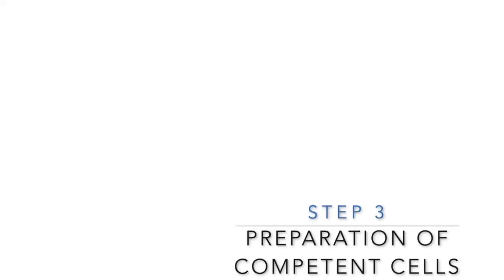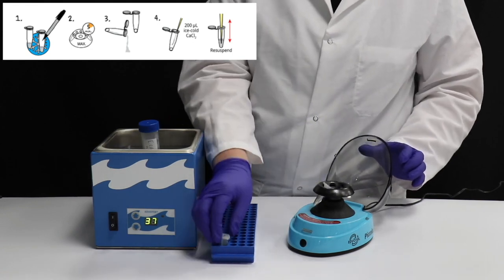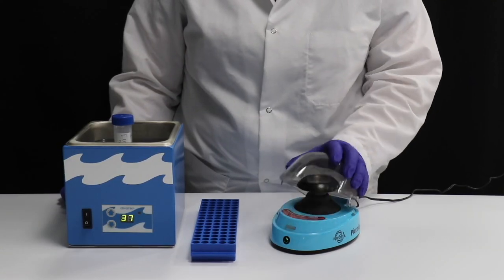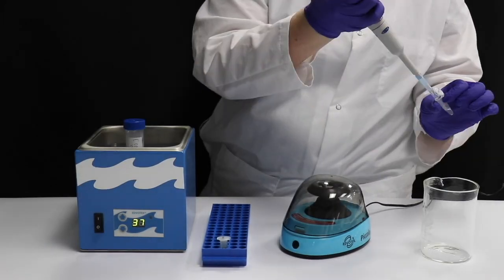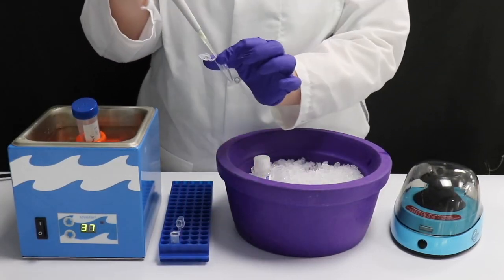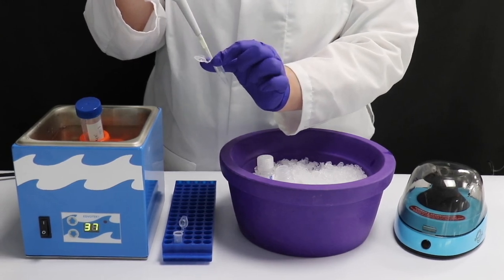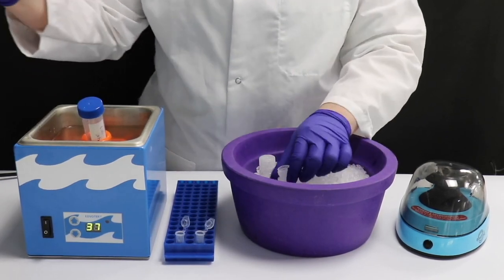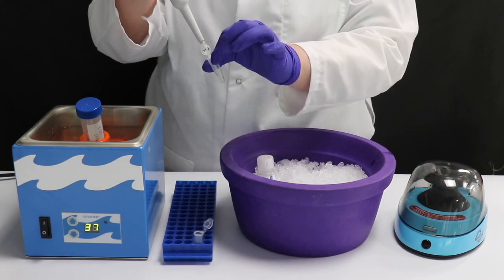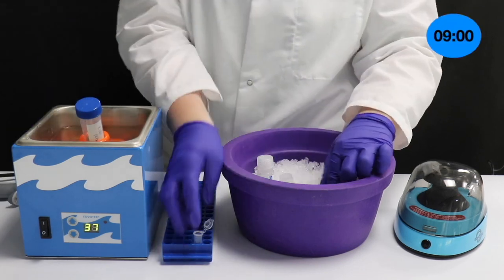Step 3: Preparation of Competent Cells. Each student group should obtain two tubes labeled E. coli. If not done already by the instructor, centrifuge the tubes at max speed for a few minutes to pellet the cells. Carefully pour off or pipette out the supernatant without disturbing the cell pellet. Add 200 microliters of ice-cold calcium chloride solution to each tube. Gently re-suspend the cells by slowly pipetting up and down several times, saving the remaining calcium chloride on ice for a later step. Make sure the cells are fully suspended — continue to gently pipette until no clumps are seen in the calcium chloride solution. Incubate on ice for 10 minutes.